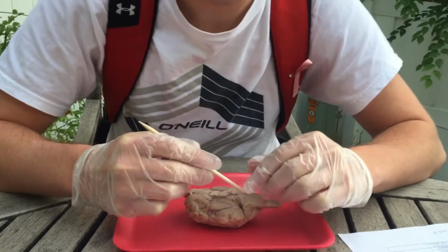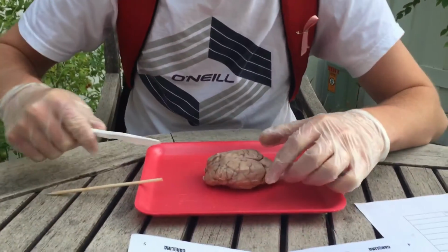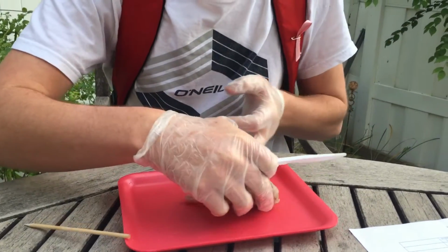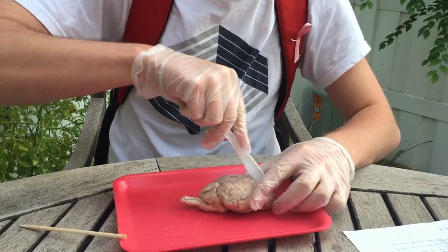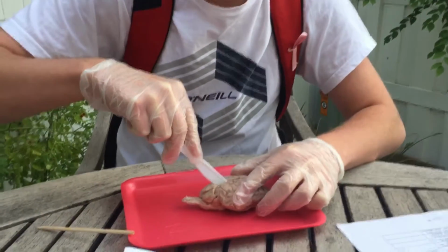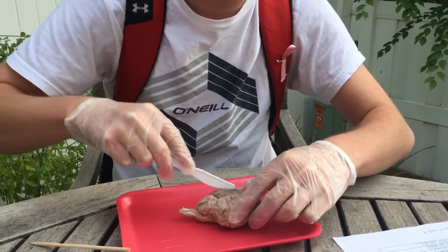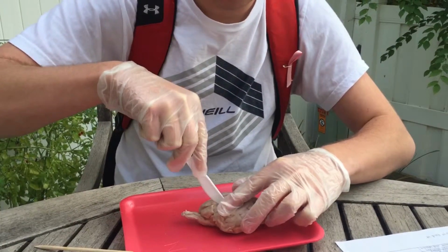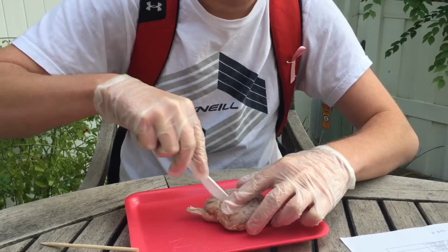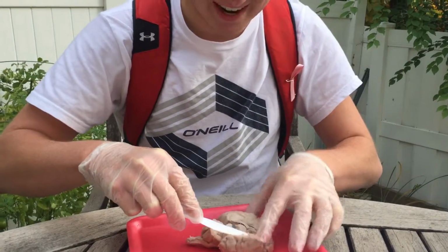Then we're gonna cut this bad boy open. Wow. The noise is so gross. I know. All right.